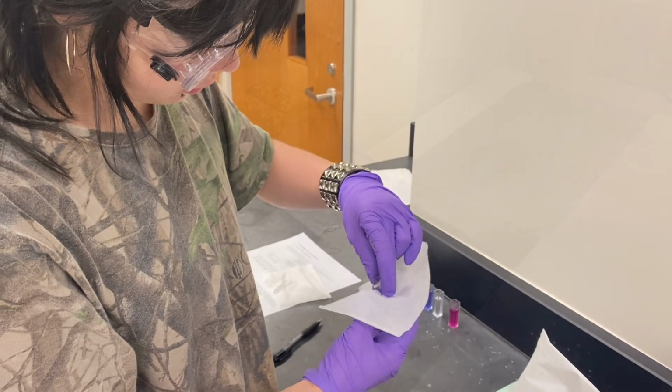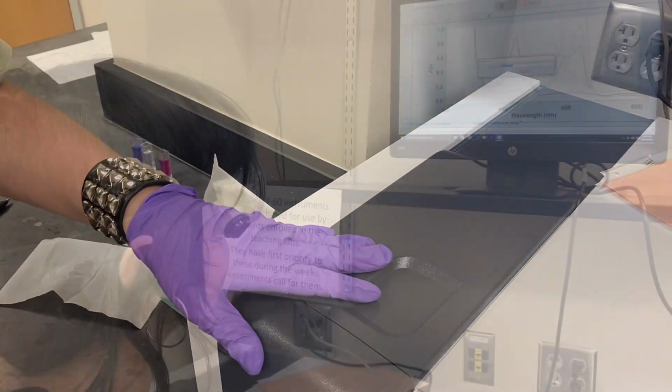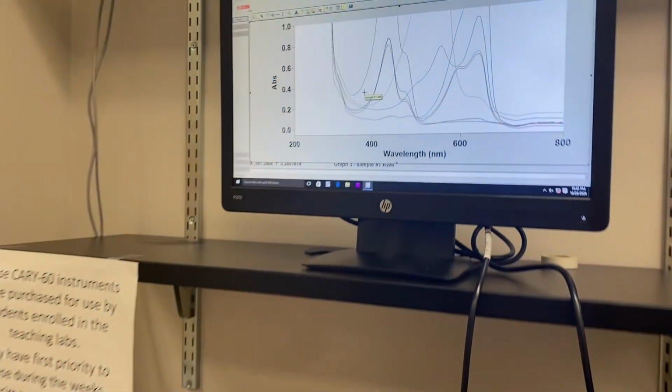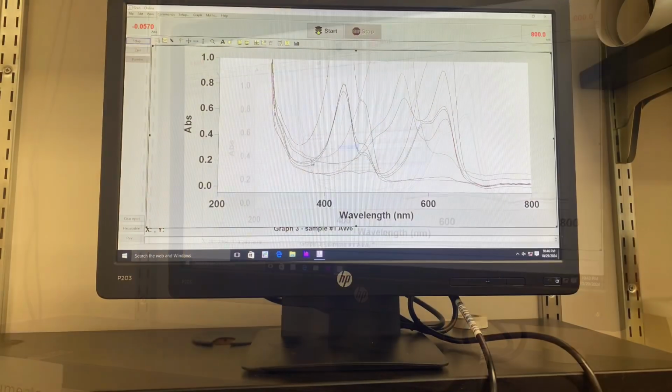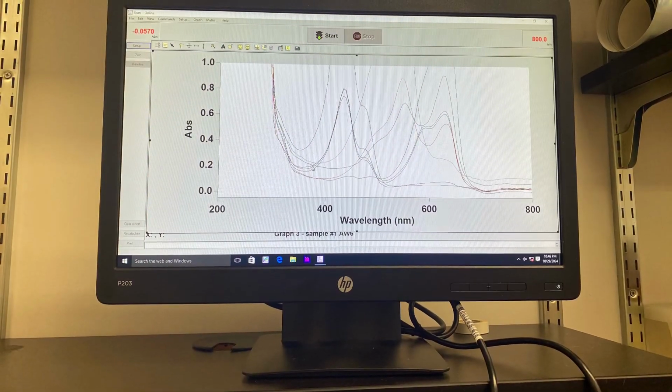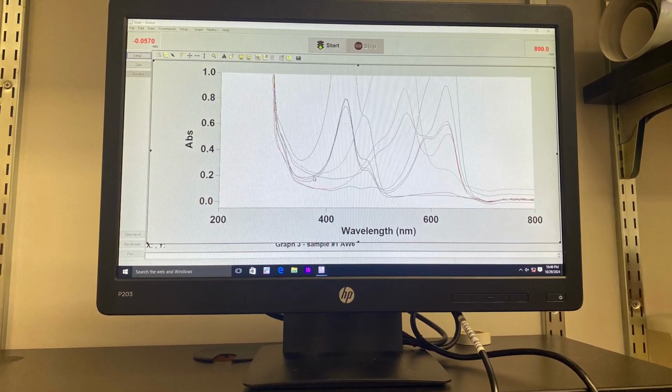Now we will perform the same steps as mentioned previously to perform our last reading. Instead of pressing OK, this time select Finish and observe your wavelength. We will qualitatively and quantitatively compare our wavelengths and graphs observed to identify the substance that makes up the solvent.